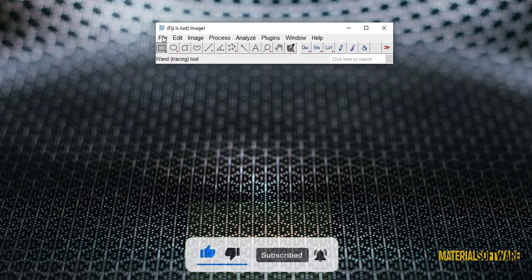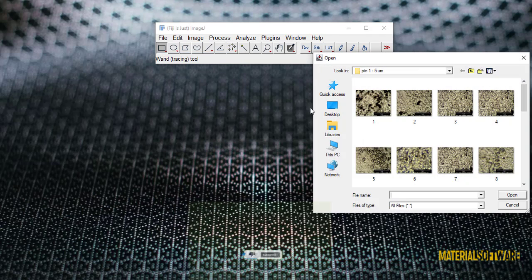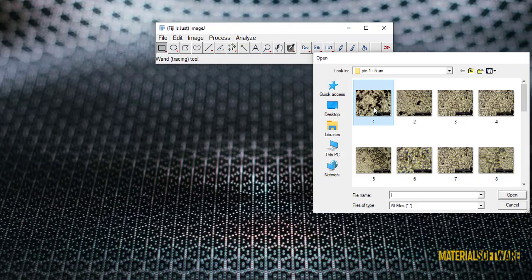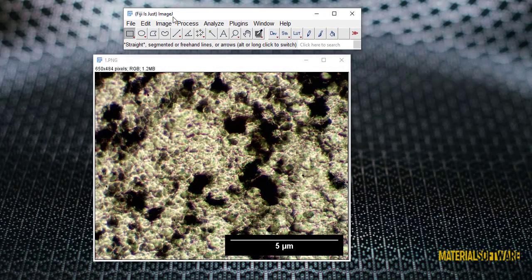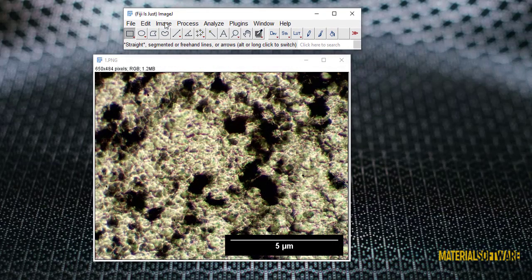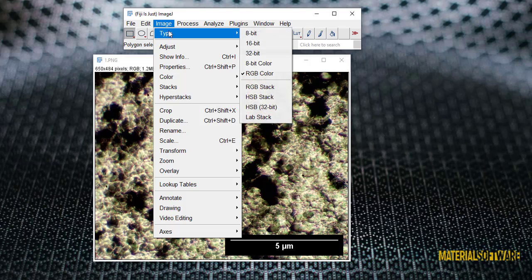Let's go to the software. We open the image in the software. To calibrate the image, we must first make the image type 8-bit. We select the 8-bit type menu through the photo header and our image becomes 8-bit.